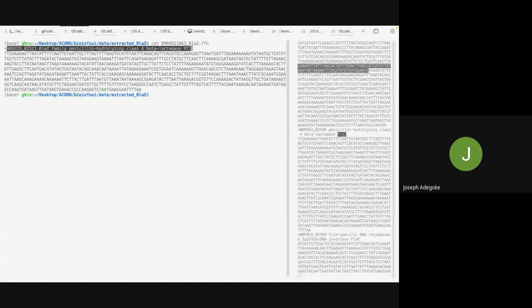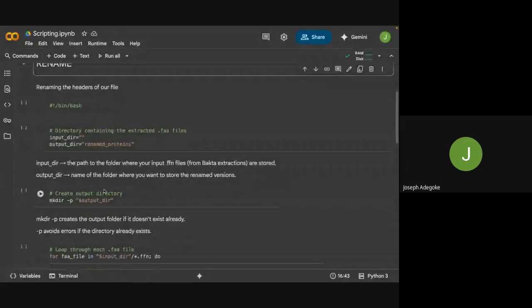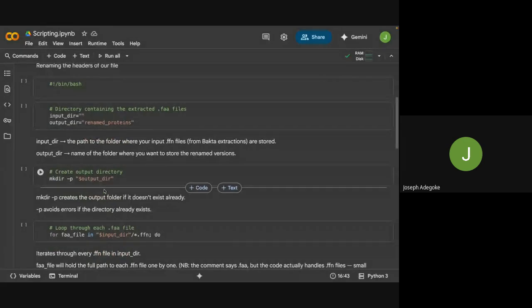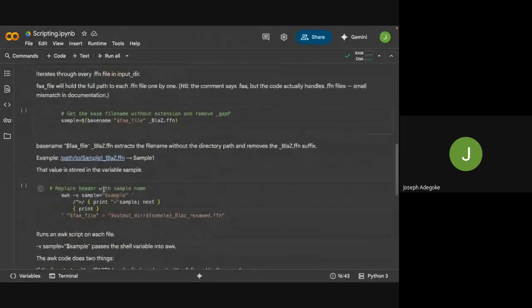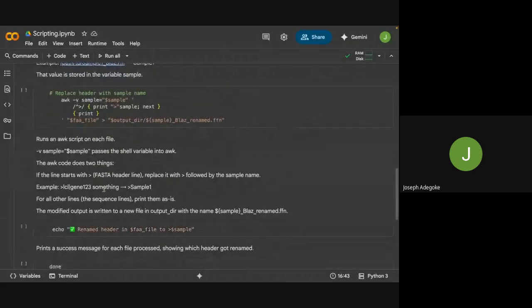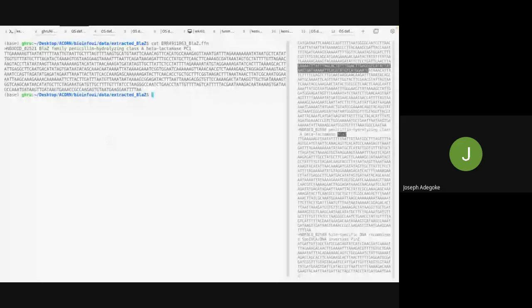So that takes us to the next script, which is almost the same thing as what we did the other time. This time around, I'm going to do it first. Let's create a script.